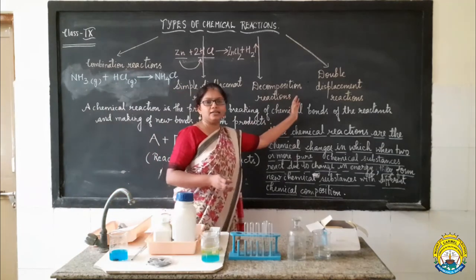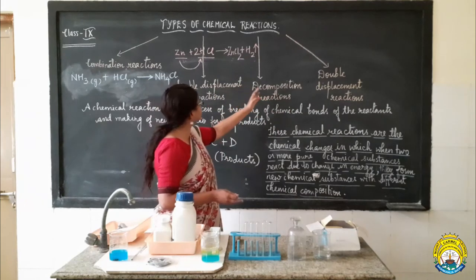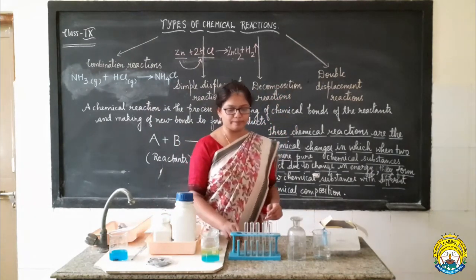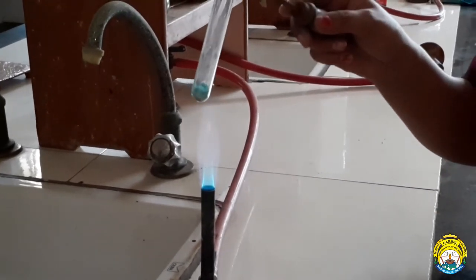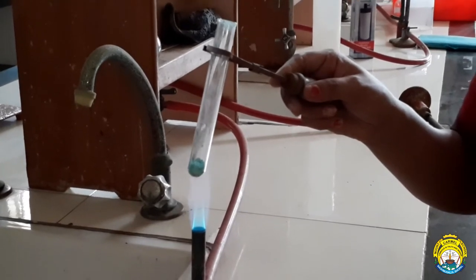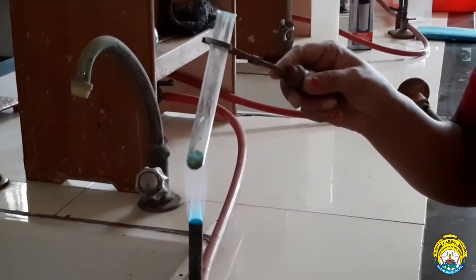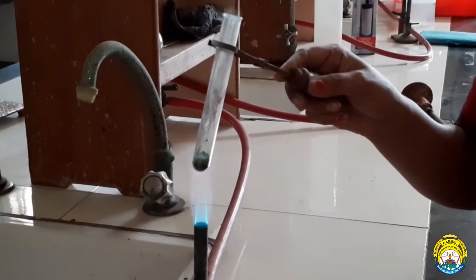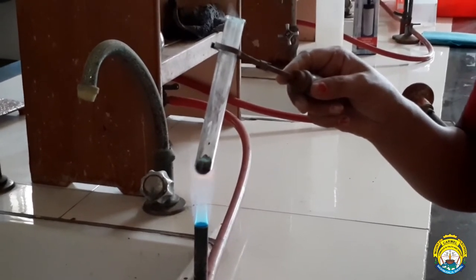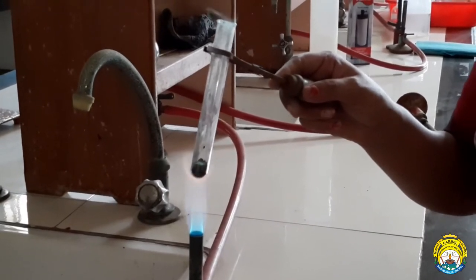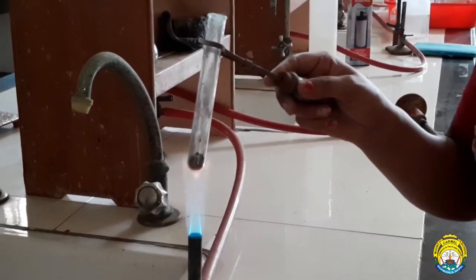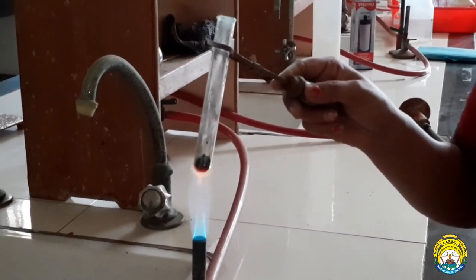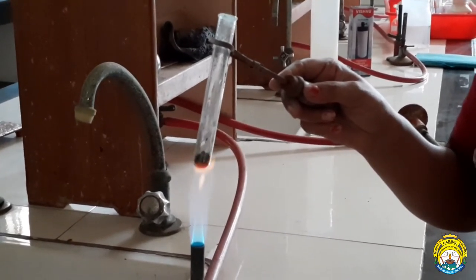Now let us come to the third type of chemical reaction, known as decomposition reaction. Let me show you something. This is a bright green color copper carbonate salt. I am going to heat it directly on the flame of the Bunsen burner. Let us see what will happen. Can you see? The green color dry salt of copper carbonate is getting converted into a black color substance.